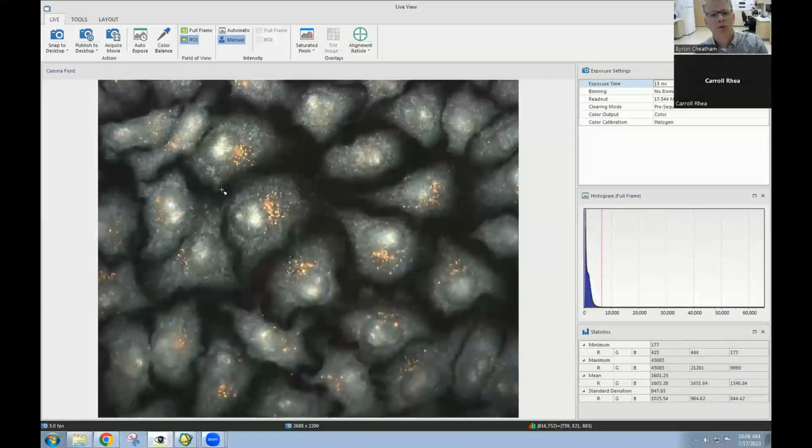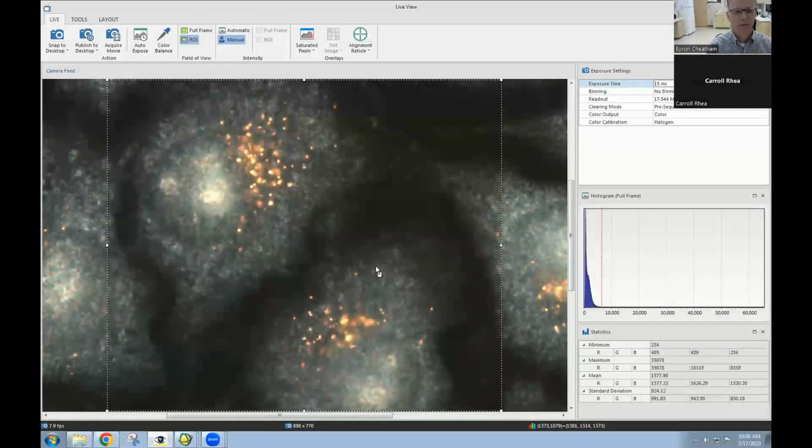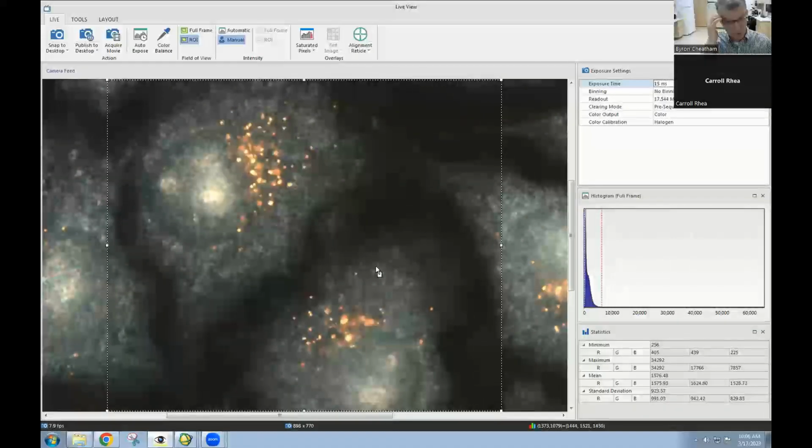One of the things I want to do before I close out is a digital zoom really quick to show you how detailed you can get with a dark field image, an enhanced dark field image of these cells. You can see now a little bit of movement as there's just vibration from lights and that sort of thing in the room, because we're at a 60x objective and we're probably another 20x magnified. We're about 1200x on this.